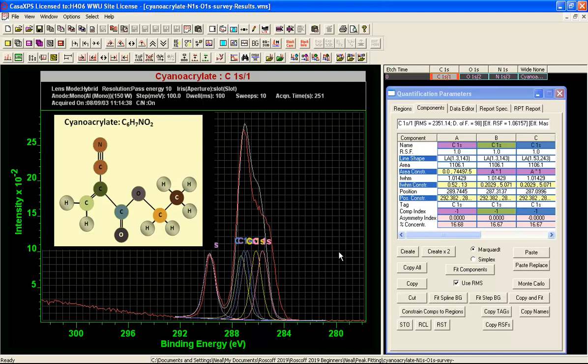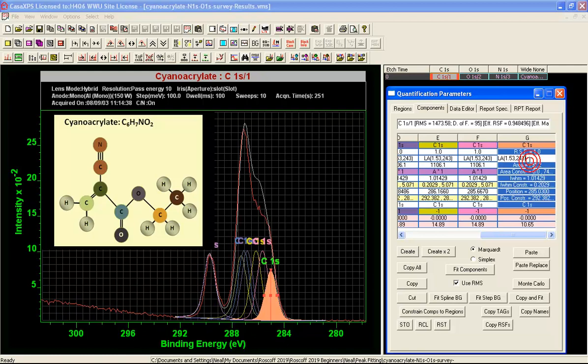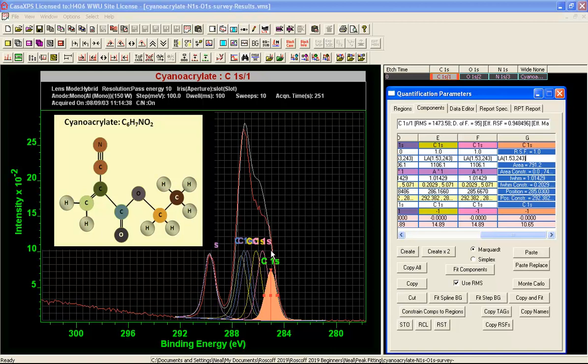And then finally I need to add a peak and this one corresponds to the excess of what we would expect over and above this because our survey spectrum and our high resolution spectra indicated we've got more carbon than the oxygen and nitrogen. So I've added a peak here. And at this point the synthetic envelope is not too dissimilar from the measured spectrum.